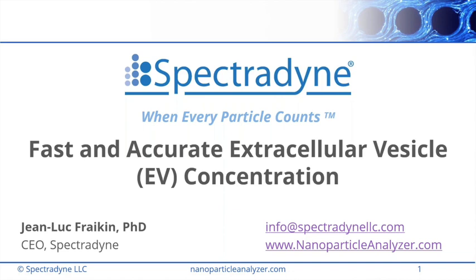Okay, thank you. There's another question. Do the cartridges use deterministic lateral displacement as the filter? I believe that technology is referring to an array of posts where different size particles go different directions than each other. So assuming that's true, then the answer is no. What happens at the filter is it's essentially just a network of small fluid channels that are the same size as the nanoconstriction itself, as the sensing constriction. So it's much more likely that a large particle will stop at the input filter because it won't be able to go through the same constriction, and that reduces the blockage events of the constriction. Does that make sense?